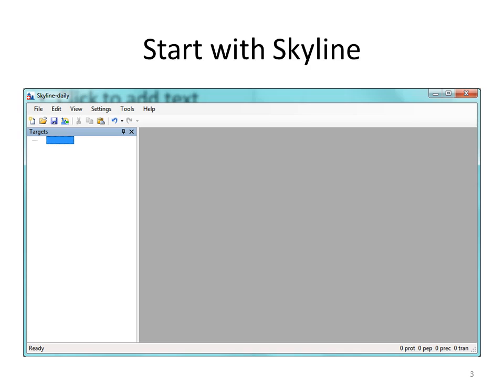So, can everybody open up Skyline? We're going to generate a spectral library. You just need to open up an empty Skyline document. Yes? Can you just tell me again the 3 folders that you wanted us to pull over? Yeah. CE opt, transition selection, transition something, and library. Yeah.